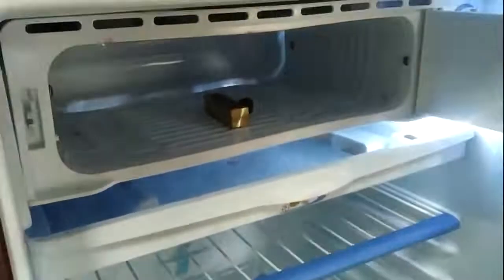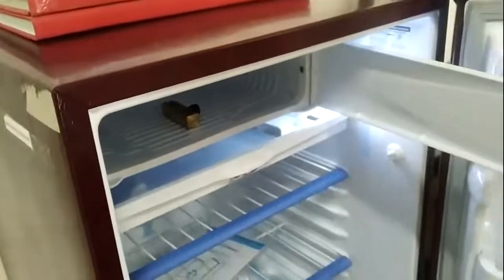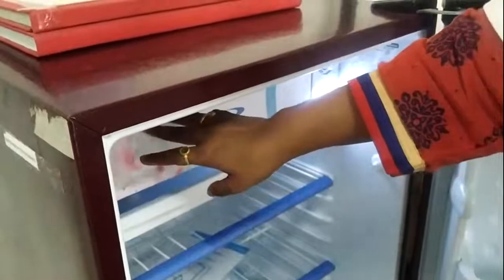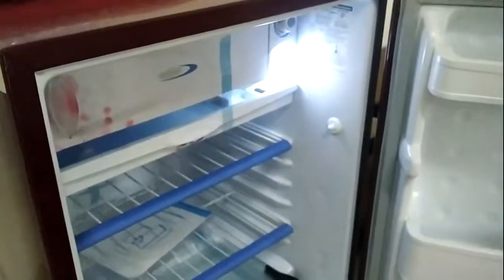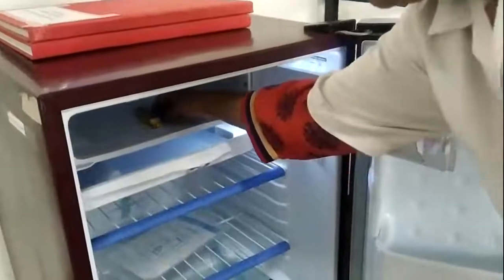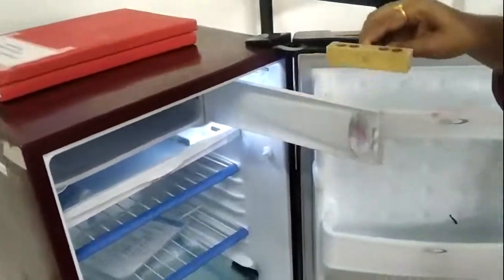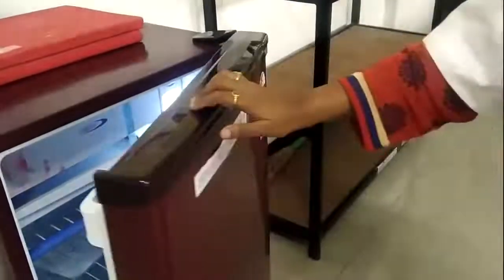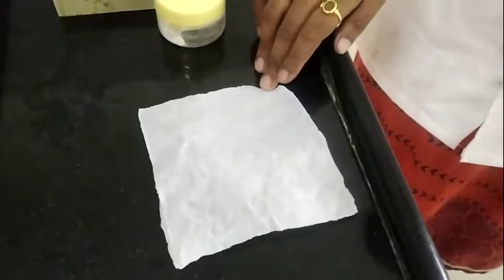Now I am going to put this overfilled suppository mold into the freezer and freeze it for the next few hours till the suppositories get formed. See, after a few hours our suppositories are formed and frozen properly. So now I am going to wrap each suppository separately in butter paper, and then we will store them in this wide mouth container.